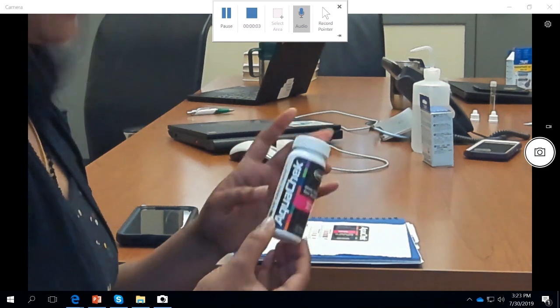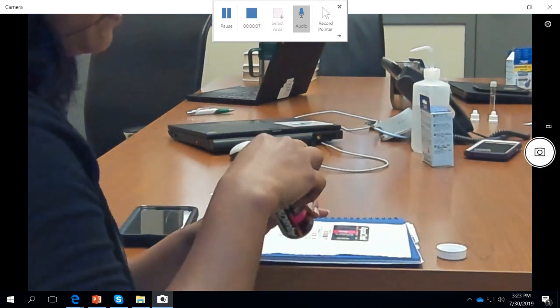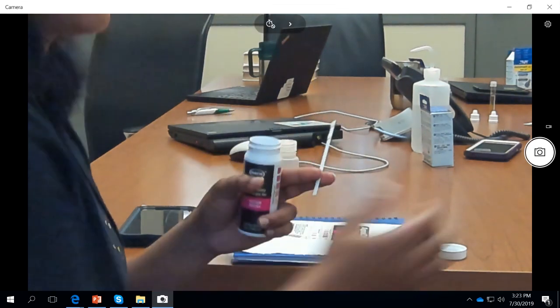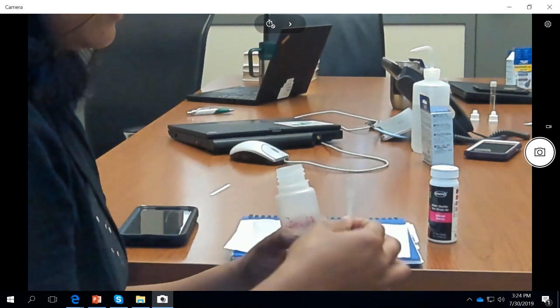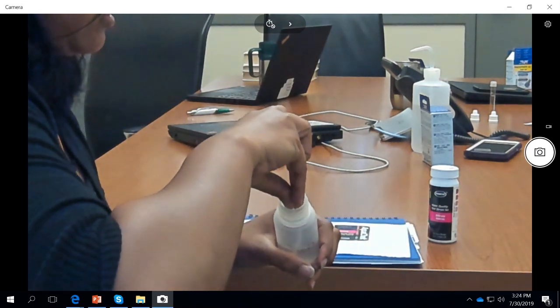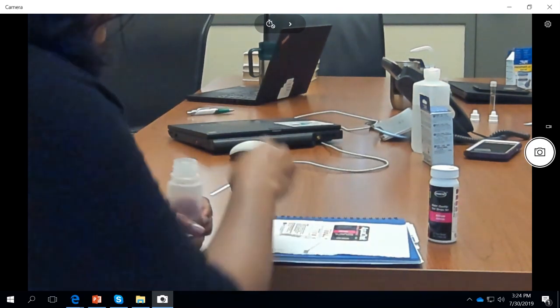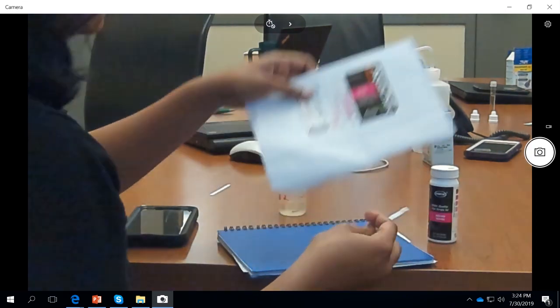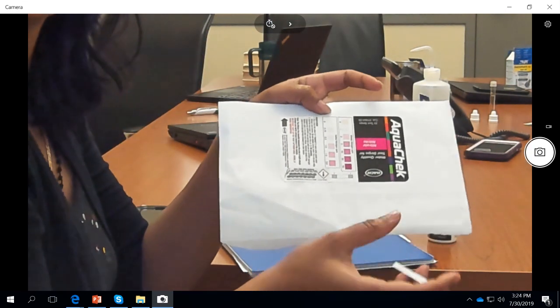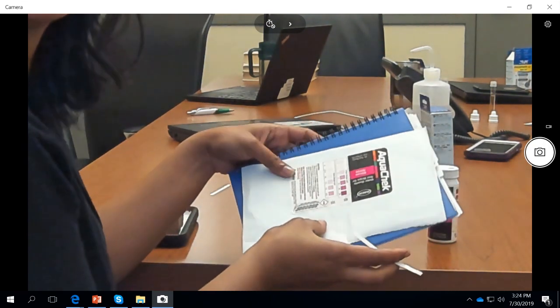This is the nitrate test kit we are using. So I'm taking a strip and dipping it in the sample for 1 second. Then I have to wait 30 seconds. So I have peeled off the sticker reference card and stuck it on a paper so that it's on a flat surface.